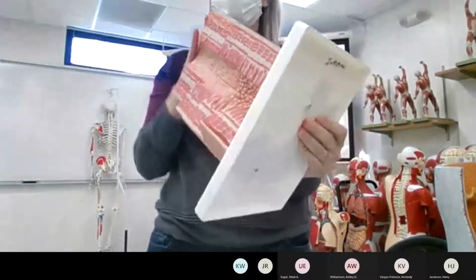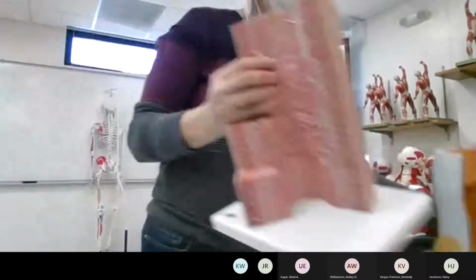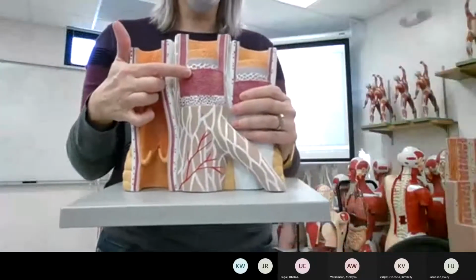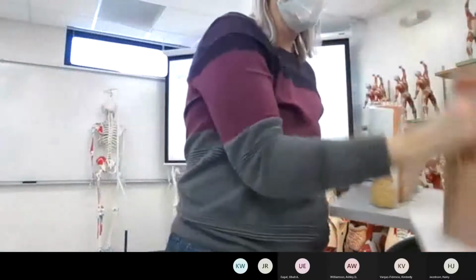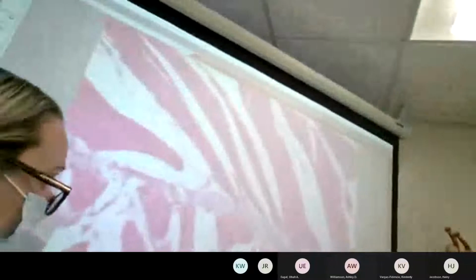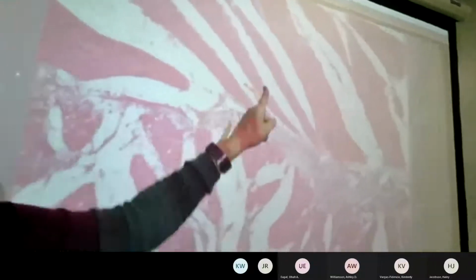Typically, smooth muscle runs in the tubes and pipes of our body. It's also represented here, in red, in our blood vessels. It tends to run in circles. One layer is a circle, and the other layer runs long. In our slide here, you can see some of these cells are shooting out at us, and some of these are running long.